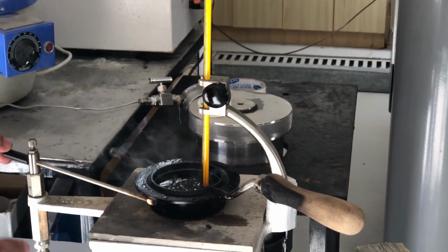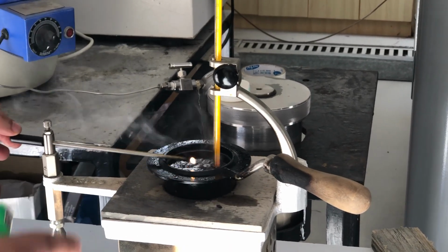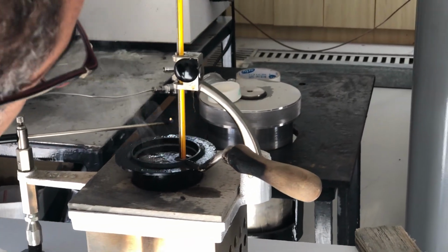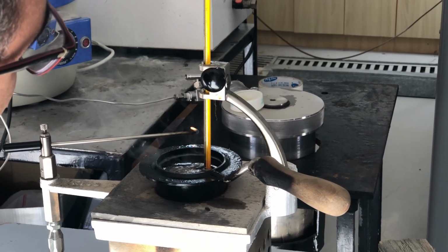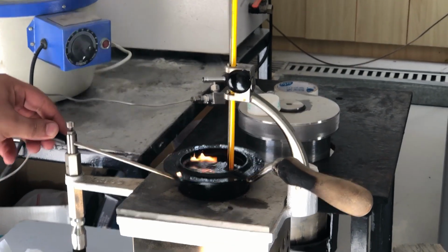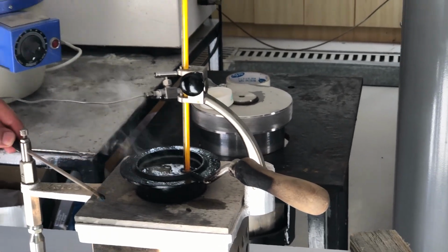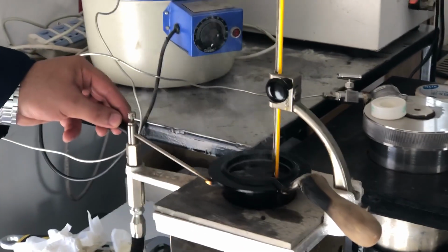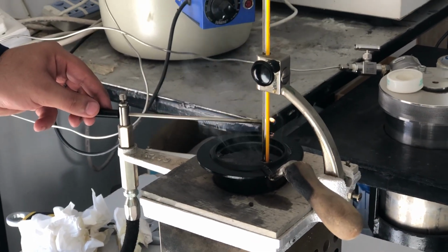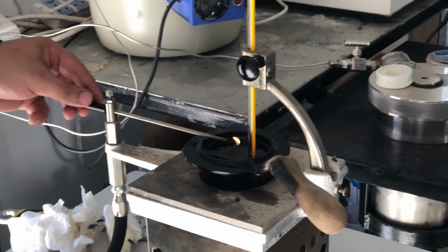Yeah. And now it is flashing. You see that the flash is coming. Now the temperature is 272 degrees Celsius. See, if I continue, more flashes will come and go. We continue until we have a constant fire.